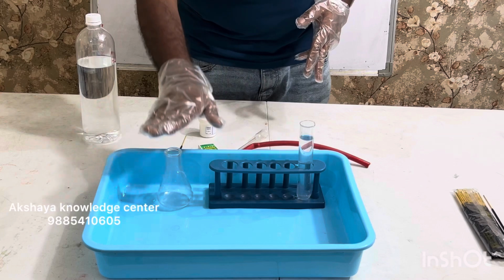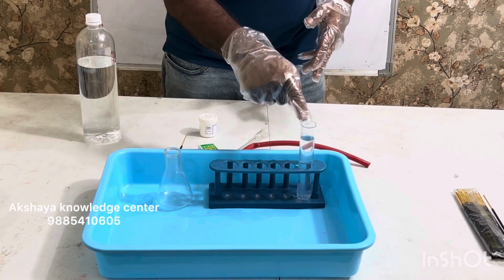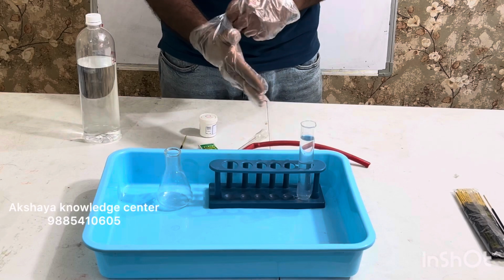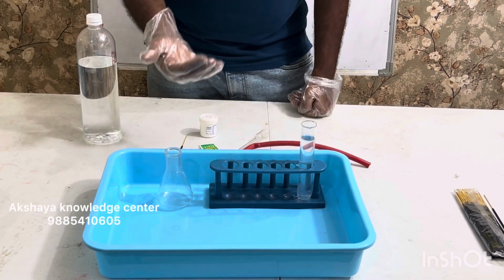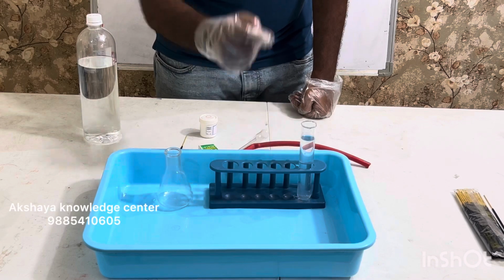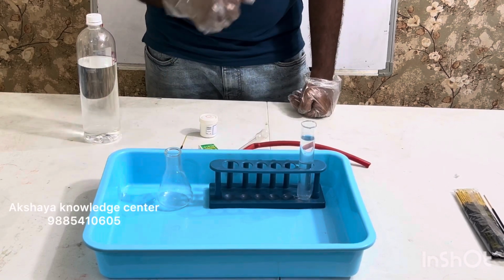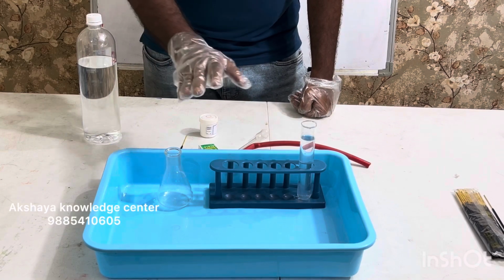Once we complete this experiment, the next thing I am going to do is pass the gas from this conical flask into lime water. Lime water is nothing but calcium hydroxide solution, Ca(OH)2. This is lime water, it is colorless. We will see if there is any change in color when we pass the gas. So shall we try this out?